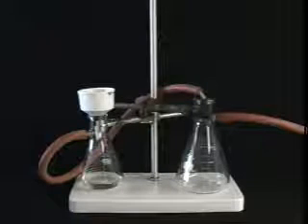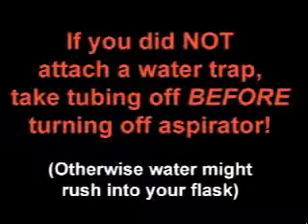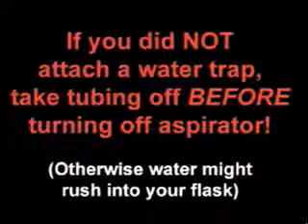Allow the filtration to come to an end. Once you think it has, then it's time for turning off the aspirator. If you did not attach a water trap, take tubing off before turning off the aspirator. Otherwise, water might rush into your flask.